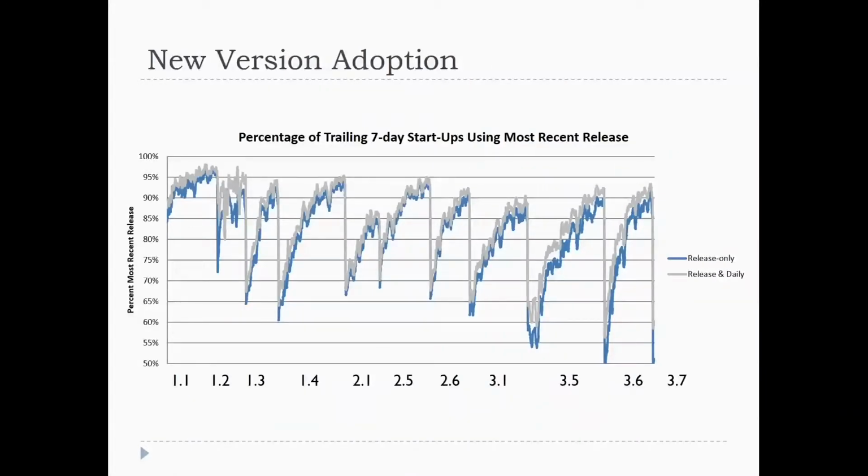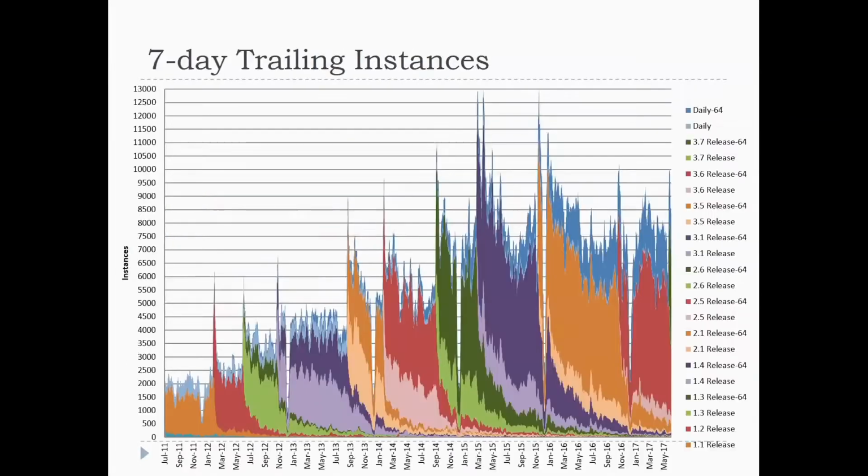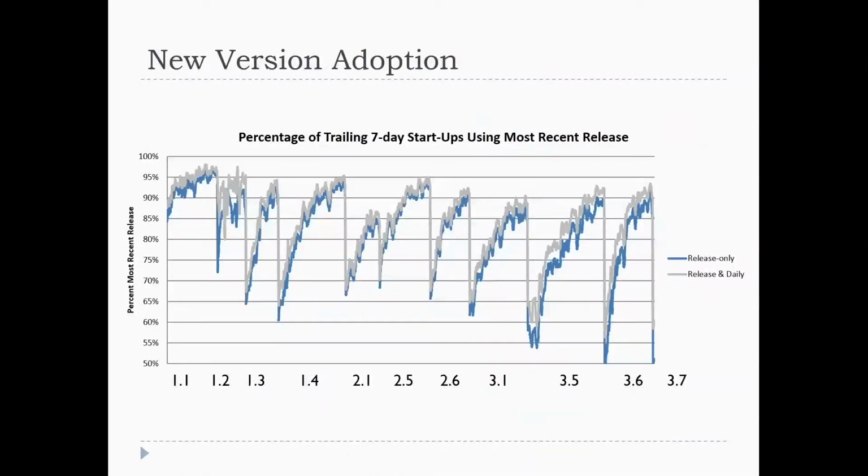So then this is a plot that I did for Mike maybe 2 years ago, when he saw one of these plots and said, oh, it seems like people aren't upgrading as quickly. And I went, well, okay, this is the upgrade plot. From 1.1 onward, you can see within 7 days, how deep do we go? It used to be that within 7 days, we were rarely below 65% of our users, so rarely below 35% of our users hadn't upgraded. And just as I was saying, we're going deeper now. Within 7 days we're at 50%, but we're still getting up above 90%.